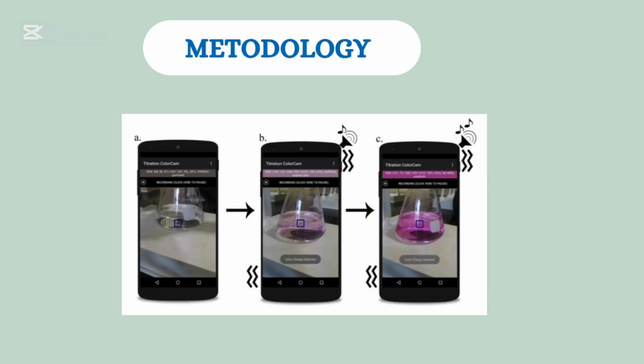Figure 1b illustrates the moment when the expected shades begin to appear. Here, the app emits short beeps and soft vibrations as an approach alert. Figure 1c shows that the color has fully entered the defined HSV range. At this point, the app emits a long beep accompanied by a sustained vibration, indicating that the titration endpoint has been reached.